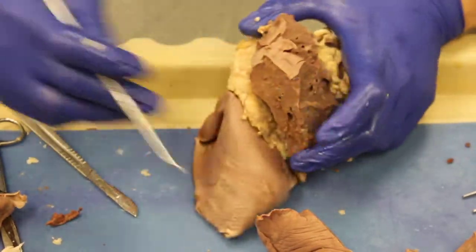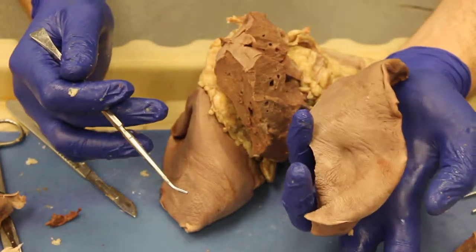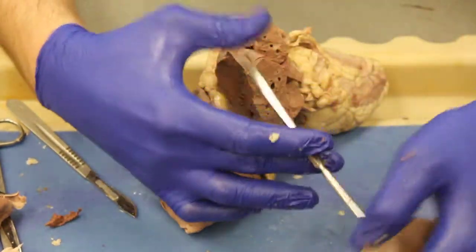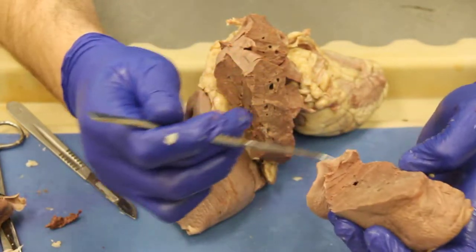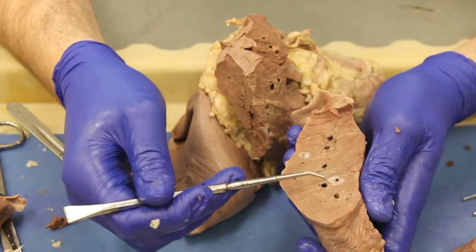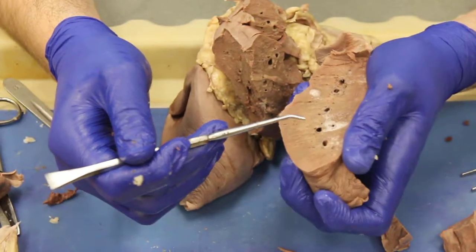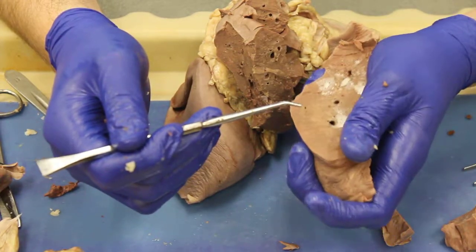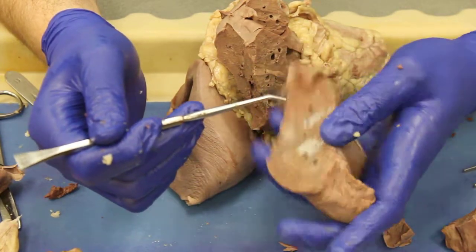All right. Now I cut this piece away from around here in the lung, and the main parts of the lung would come in from here and here, and the branching continues. So these branches branch further and further. Now this squeezing part, that's all the mucus and secretions and the surfactant coming out of that lung. All of that is mucus secretion from the lung. All of that seromucus and goblet cell secretion that we discussed back in the unit.